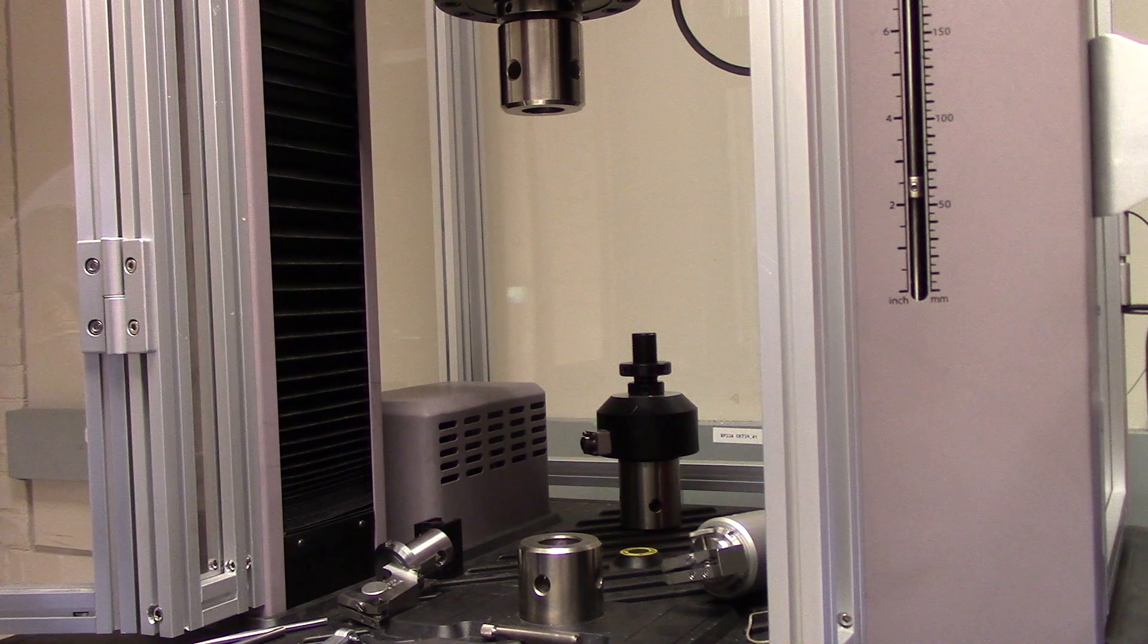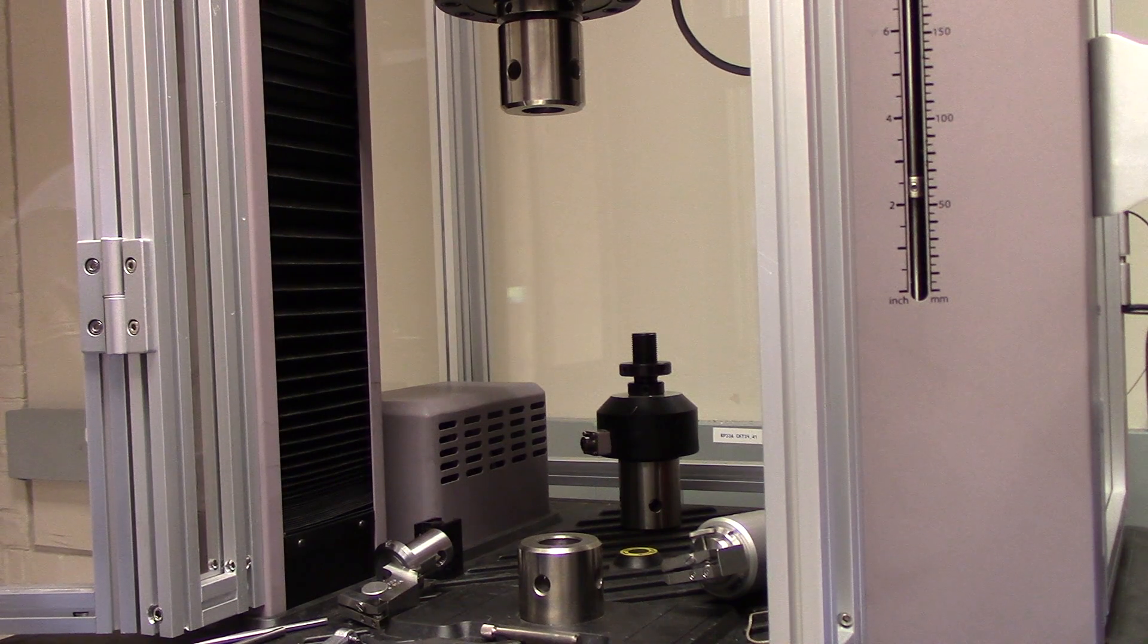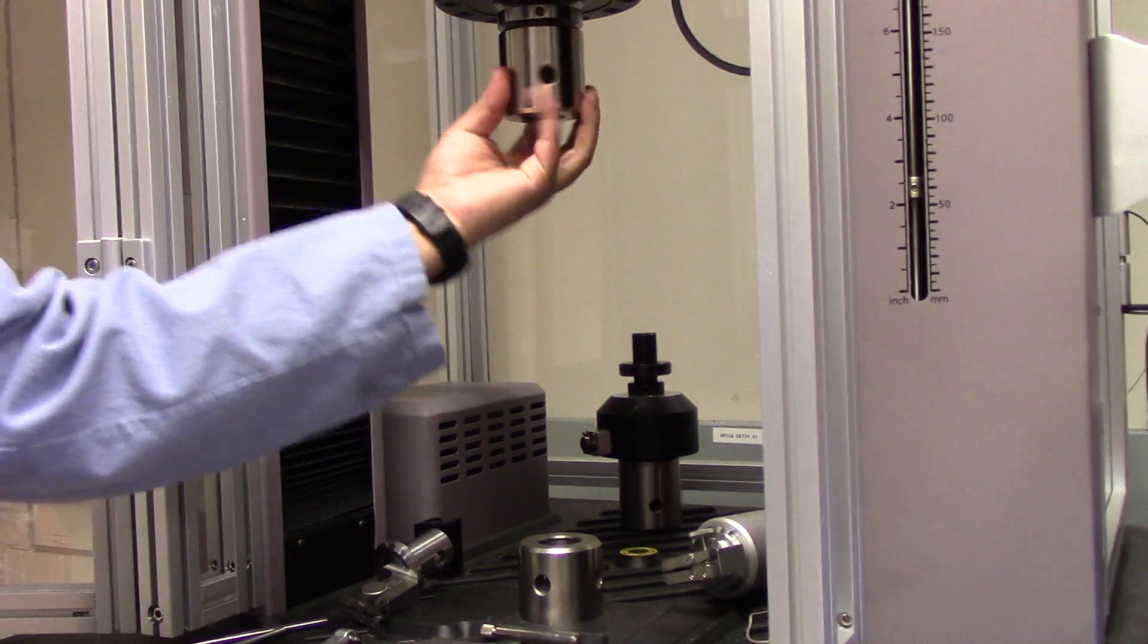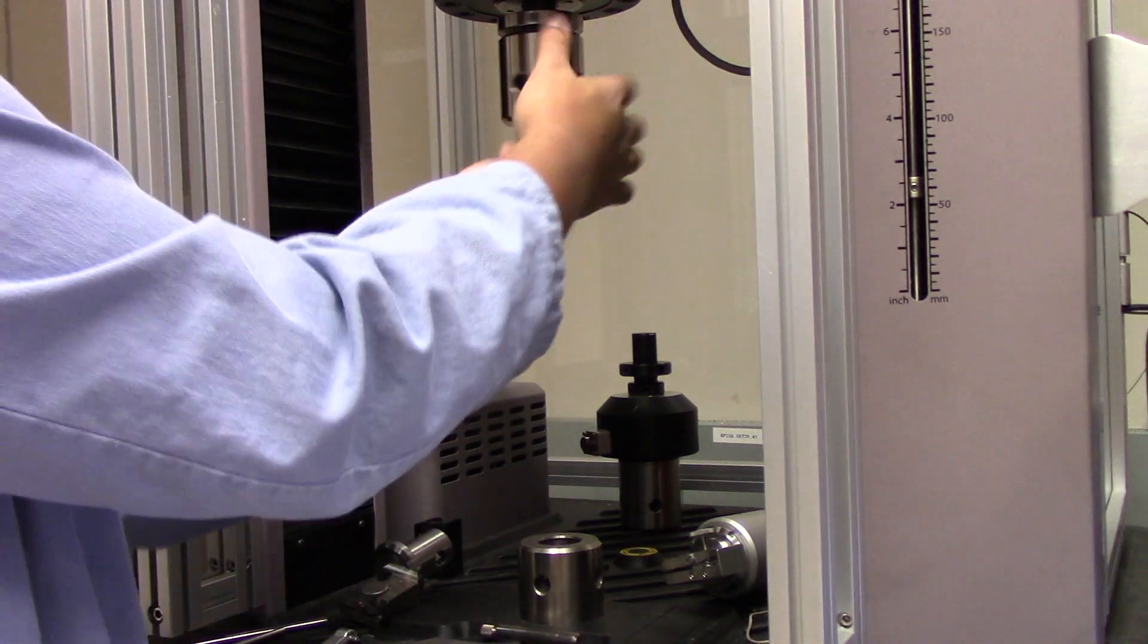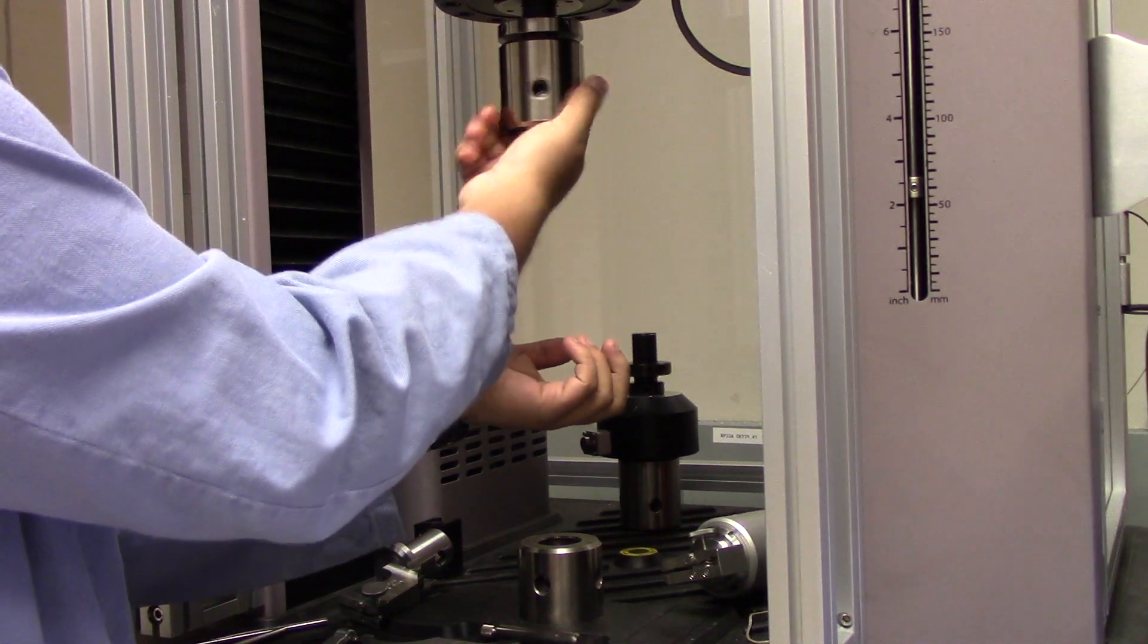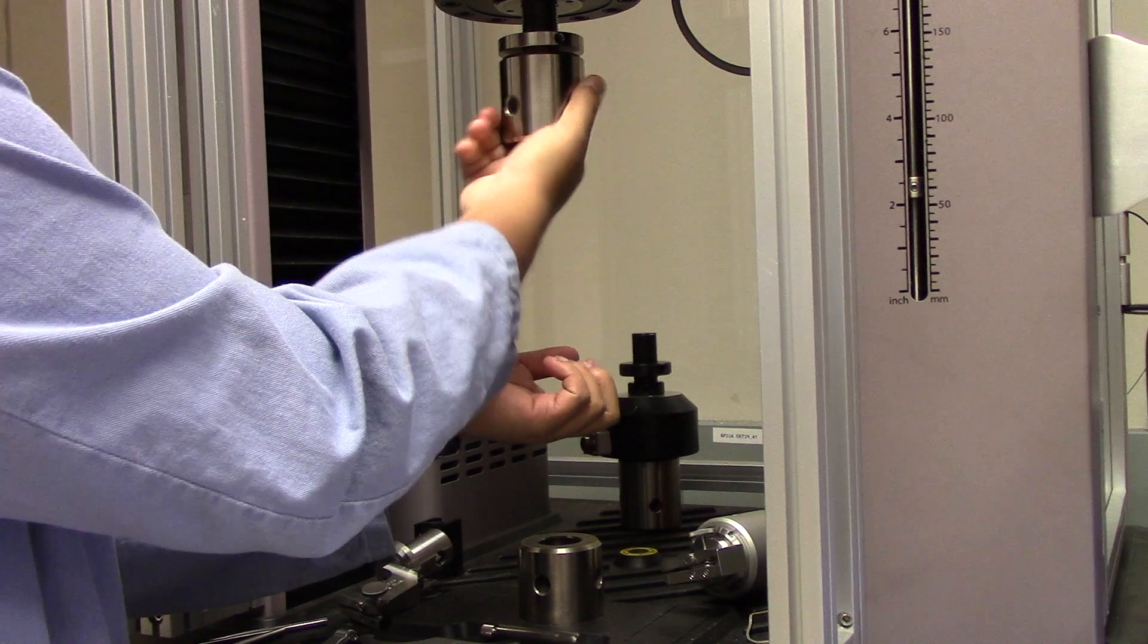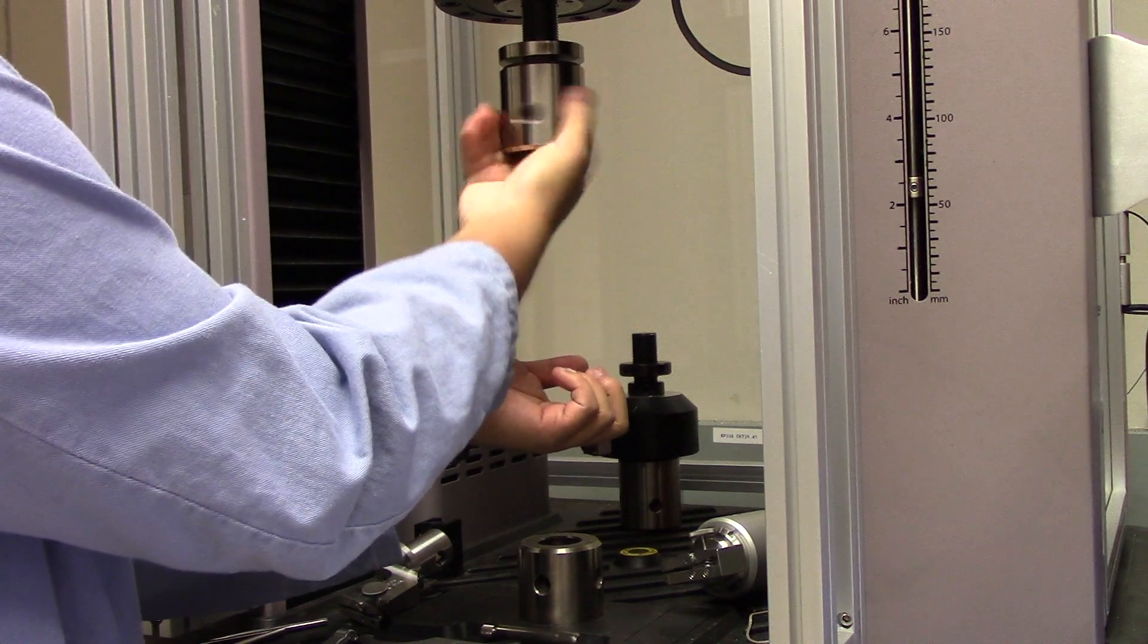First, ensure that there are no additional grips or load cells placed onto your system. If the tensile tester is all clear, then you'll want to start off with removing the receiver from the 50kN load cell by rotating clockwise. This is the area as to which your load cell will directly connect to, much like with high force testing. Just make sure to be careful though, because there is a bit of a drop.